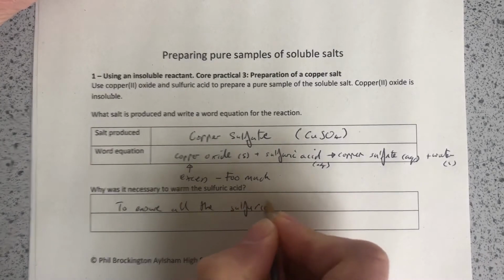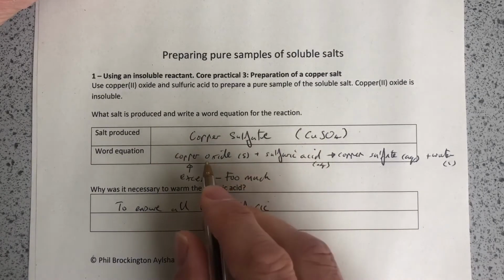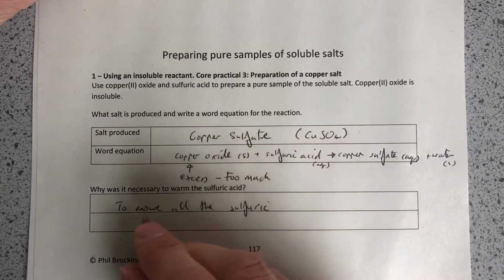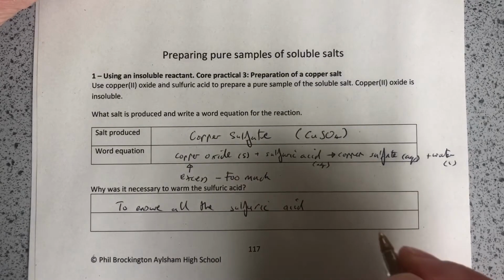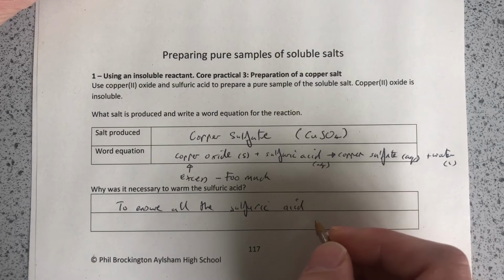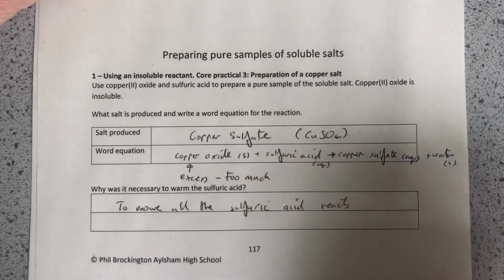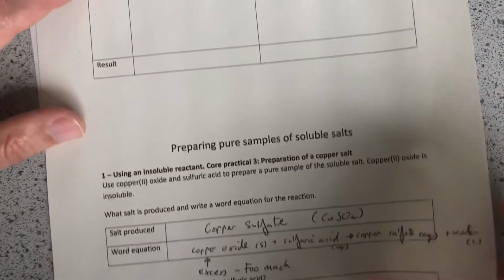So we have too much copper oxide, an excess of copper oxide. That's going to make sure there's enough copper oxide particles to react with the sulfuric acid, and we're then going to warm it up to make sure all those sulfuric acid particles do react with the excess copper oxide, to ensure all the sulfuric acid reacts. It also speeds the reaction up a little bit. Next question.